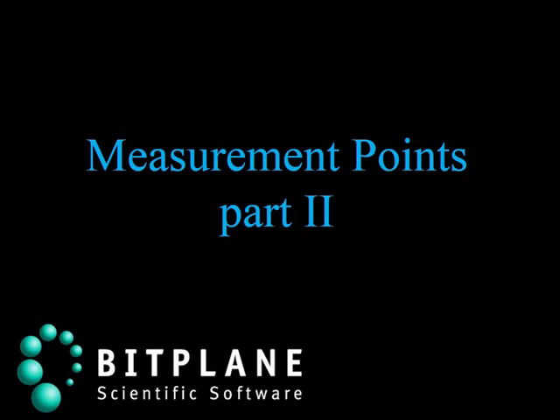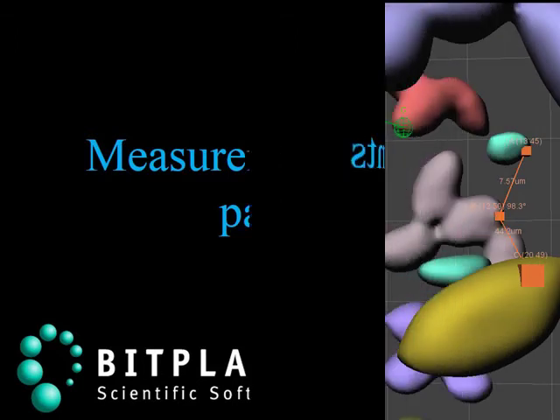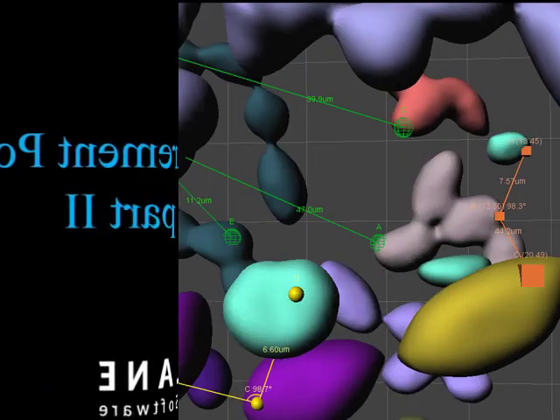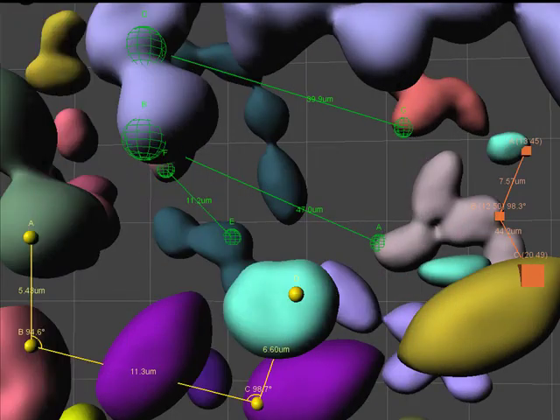In our previous video tutorial, we showed most of the wide-ranging features of Imaris measurement points.